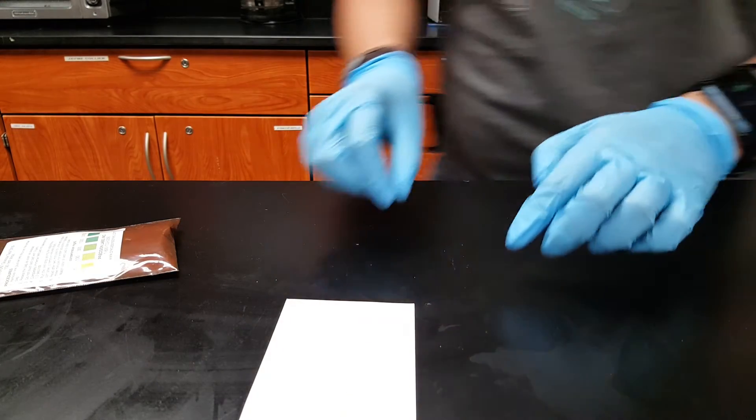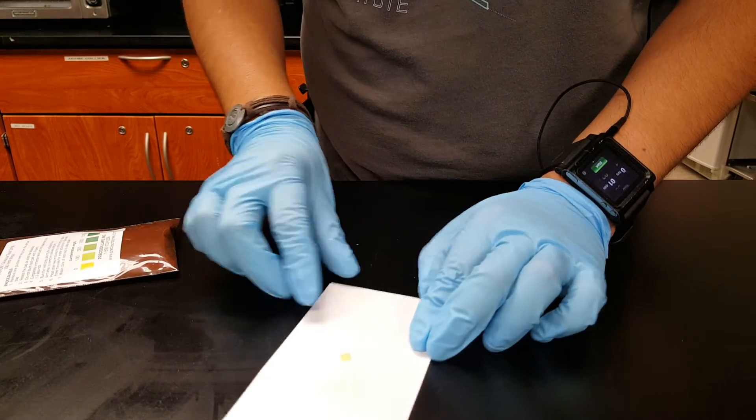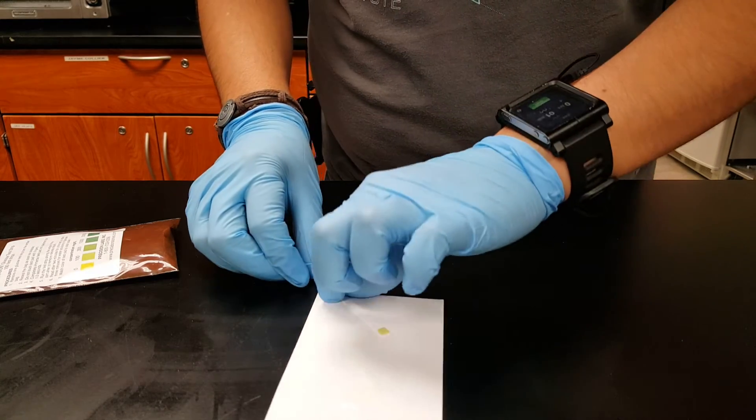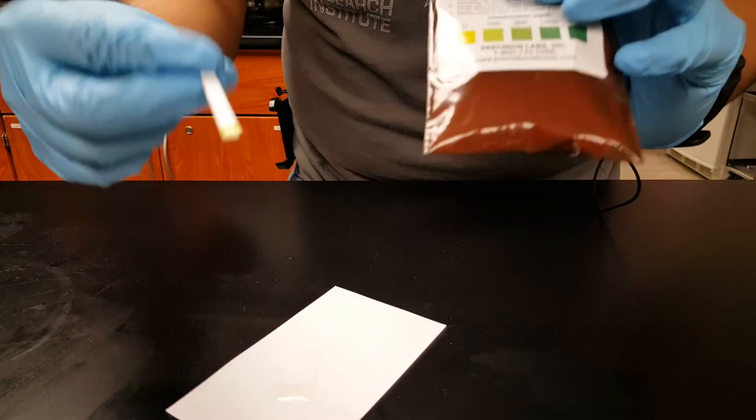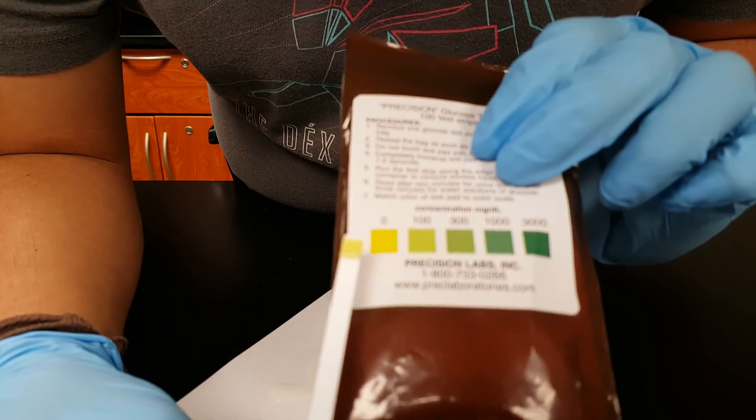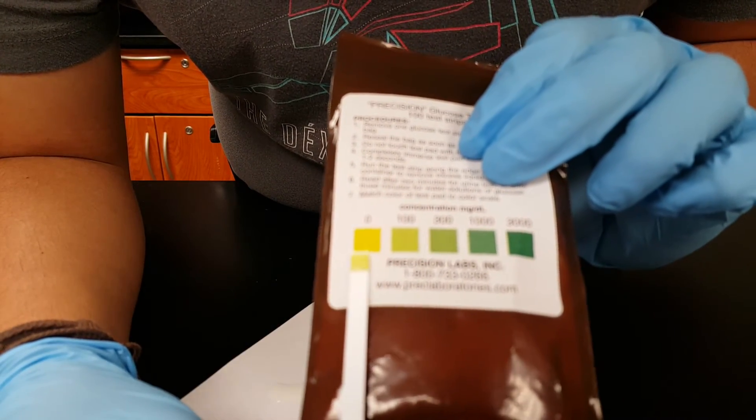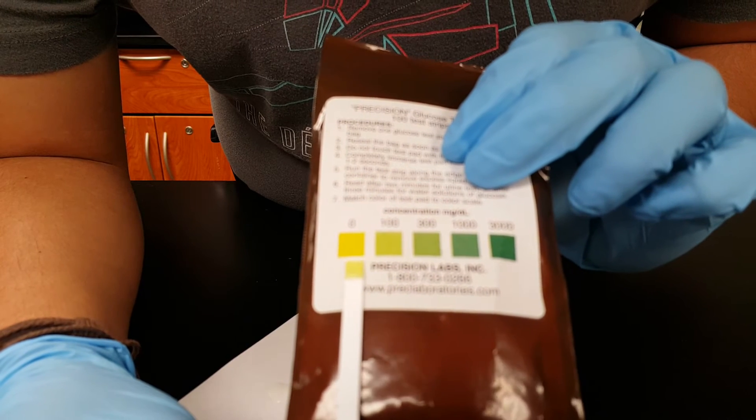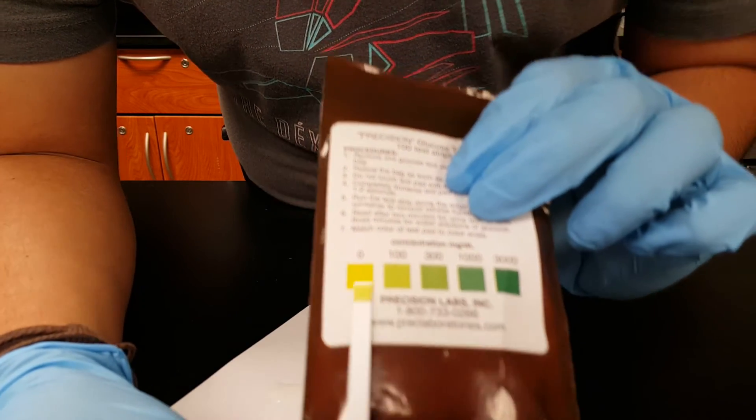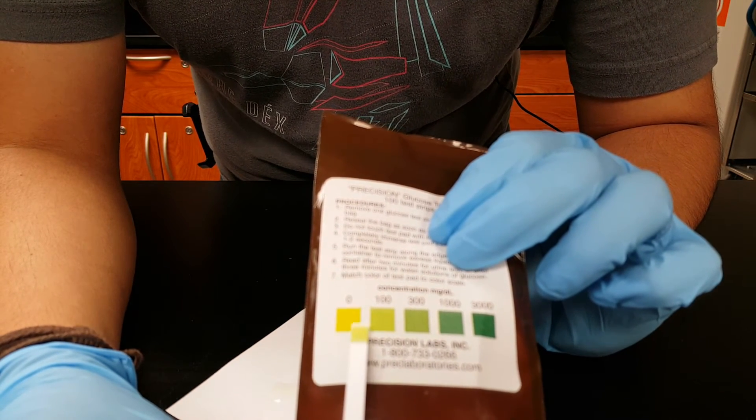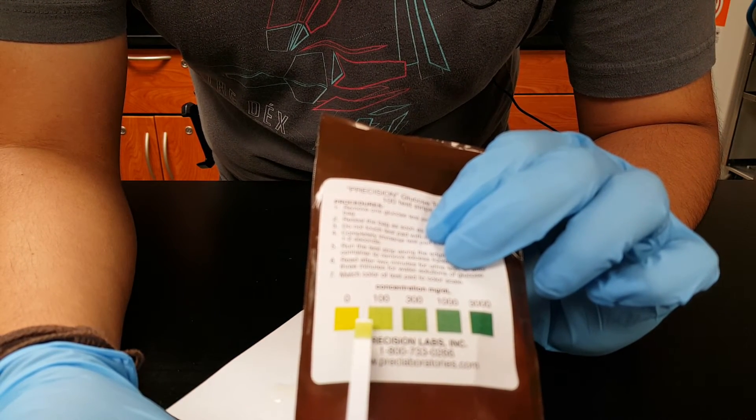All right, after the minute has passed, you're going to take your strip and you're going to show what it looks like when compared to the meter here, to the graph. And you can see that it's somewhere between zero and a hundred. So there's some activity, but there's not a lot, which makes sense because this was a very cold temperature.